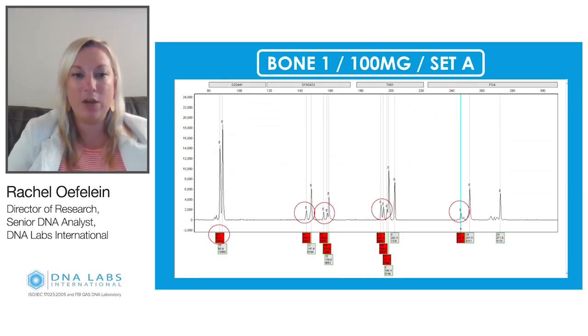Here's a zoom in on the yellow dye channel. So you can see all these extra little peaks here. Some of them aren't sizing. So you can see there's a lot of OBs, but some of these are actually falling into bins. So you would need to be cautious that this wouldn't register as a mixture. So again, this is another advantage of analyzing off the instrument is that you have additional options.